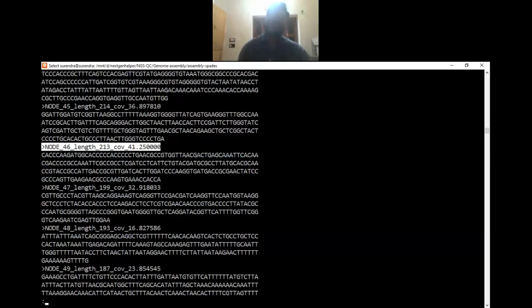No, one of our lab mates has performed this genome assembly, and the data she received, I think using SPAdes only, had in one of the sets the number of scaffolds more than the number of contigs. So it was surprising because ideally the number of contigs should be more and scaffolds should be less. Yes, I haven't seen this kind of output, so I'm not sure. Okay, sir, thank you. I think there must be some problem with the data.